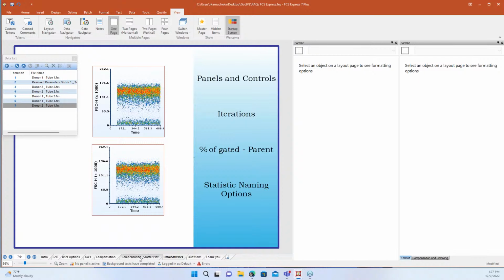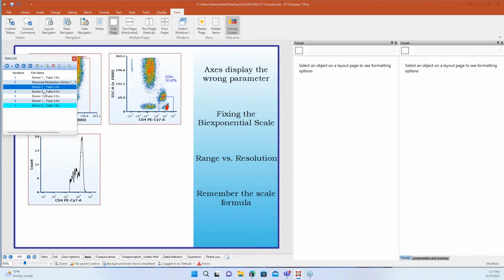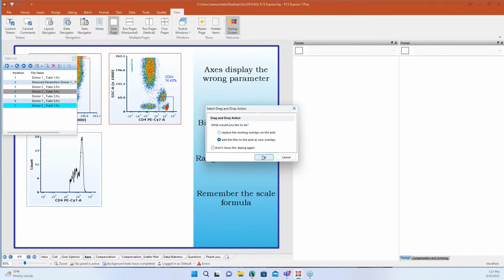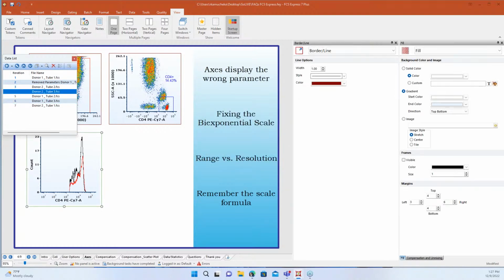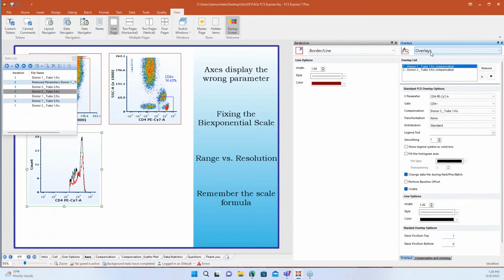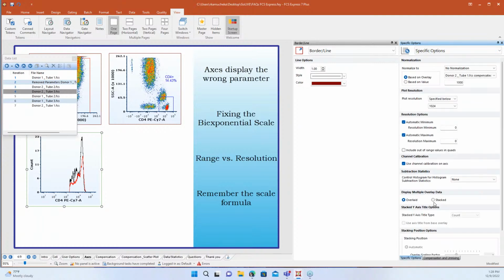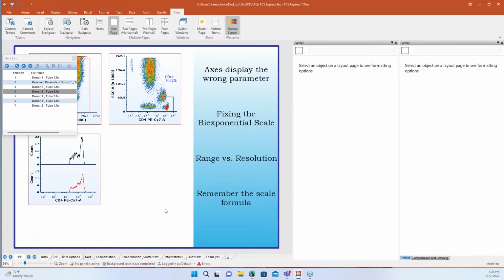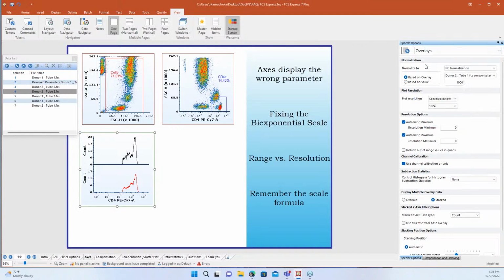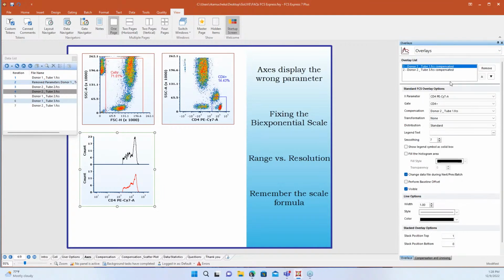So if your data analysis leads you to be doing histograms with histogram overlays, a lot of times that will gray up iterations, because what's not as obvious here is that when you have a histogram overlay, you have multiple files on that plot, right? And so it intuitively sort of feels like you don't, because it's a single plot, but you do have multiple files there. And so it's going to function exactly the same way as what Robin was describing when you try to move through your batch.